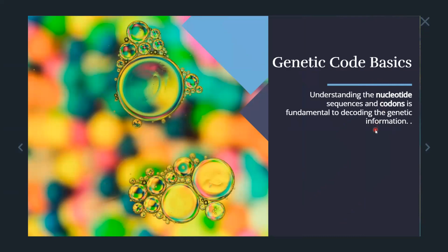In a specific gene, we are going to explore certain kinds of mutations which are related to a specific disease, and how we can uncover those mutations with respect to the identification of the most potential applications, such as biomarker identification and also potential drug target identification.